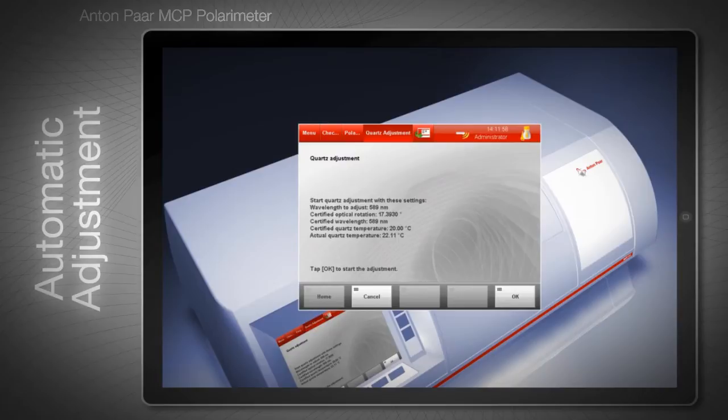Once the quartz control plate has been inserted into the MCP, it is immediately detected by the instrument. All relevant data is transferred from a built-in chip on the quartz control plate to the MCP software. This saves time and avoids errors resulting from manual data entry. The user does not have to select and enter the right reference value from several pages of data for different temperatures and wavelengths.